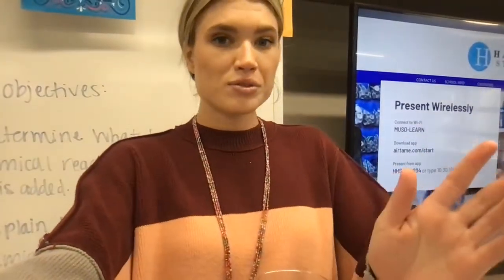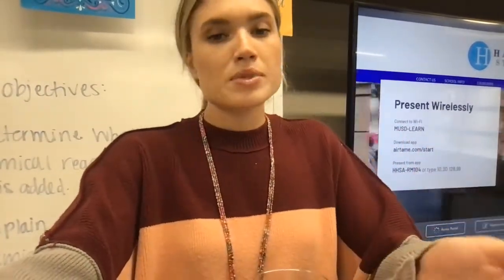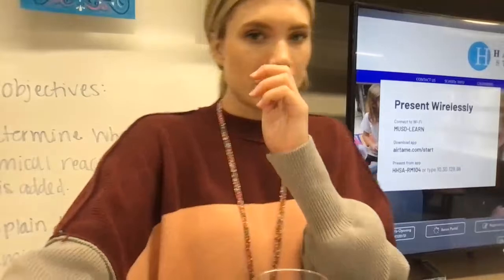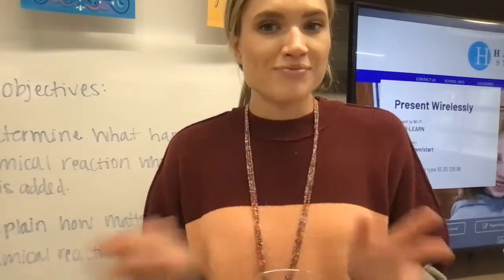We're gonna do the elephant toothpaste lab. So this is for students that are having bad internet or you're absent this day, but the elephant toothpaste lab is an assessment, so just wanna make sure that we're all able to get the information that we need.